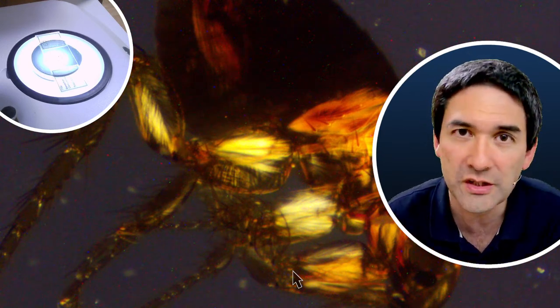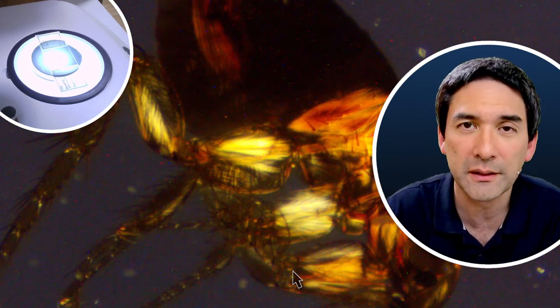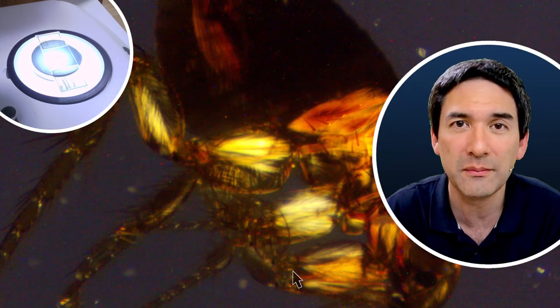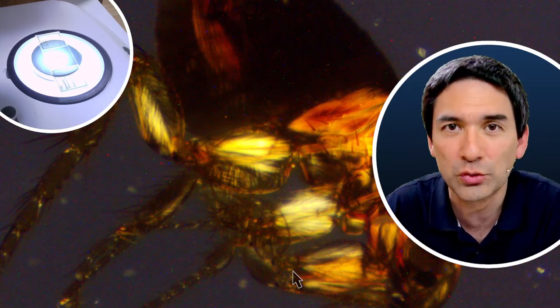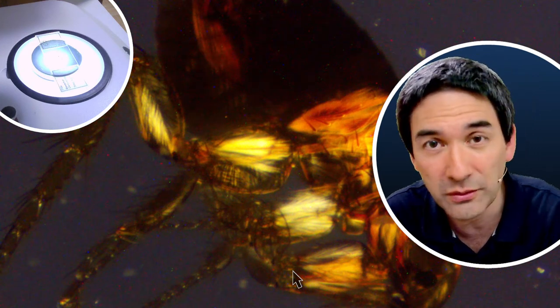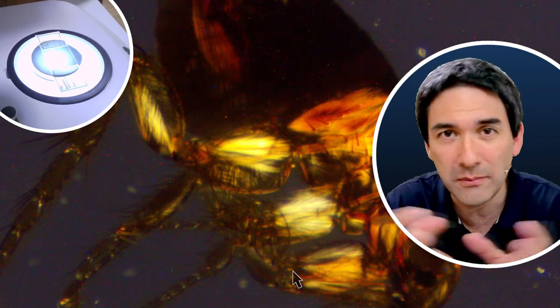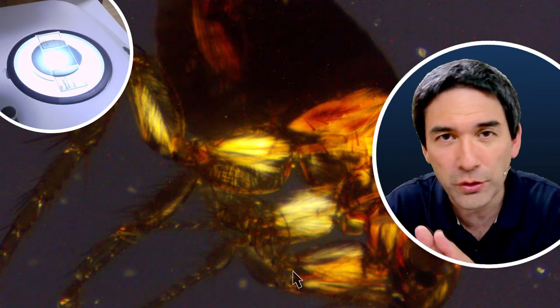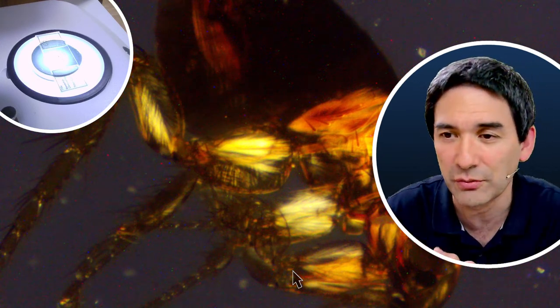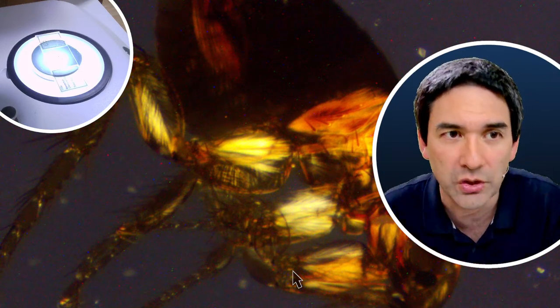I mean, the salt crystals, for example, appear white on a dark background, but if you, for example, use vitamin C, because it is an irregularly shaped crystal, in stereochemistry, if you're in chemistry, it has so-called chiral C atoms, which are basically image and mirror image, and therefore you have a rotation of the polarized light, and this gives it the colors, right? So I just want to say that not all crystals are producing equally good results.